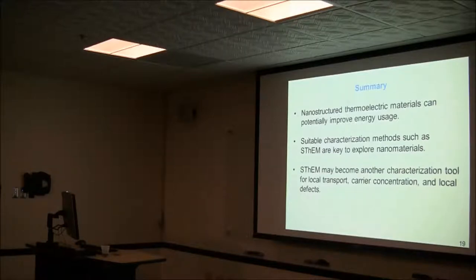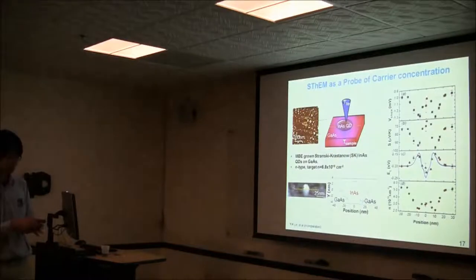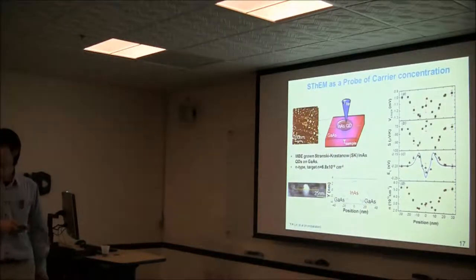Okay, cool. Did you do measurements like this on regular bulk materials and compare with the Hall effect? Did you do any comparisons to test, for example, carrier concentrations, and how closely your results match those? You mean the outside? Like, for example, this one, not something that you can do Hall on.